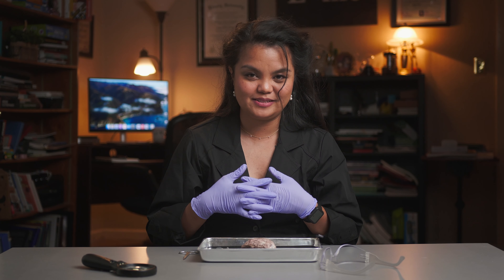Before we start tackling this brain and learn from it, as usual, let's put on our safety equipment: lab coat, gloves, and safety glasses. All right, let's do this.